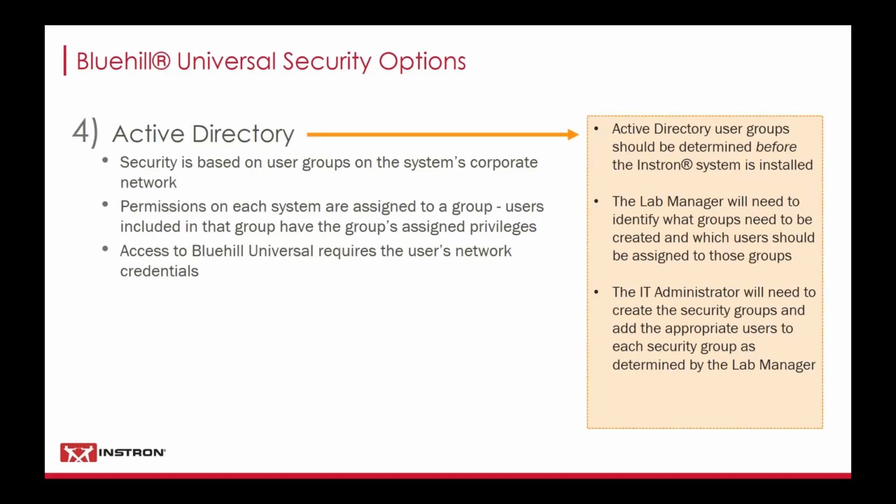And we have a handy document that a lab manager or super user in a lab that's using Instron systems can give to their IT department to work this out before the system is installed. So we'll share that a little bit later. The lab manager will need to identify what groups need to be created and what users should be assigned to those groups. And the IT administrator will need to create the security groups and add the appropriate users to each security group as determined by the lab manager. So again, we have a document that could help walk you through that.